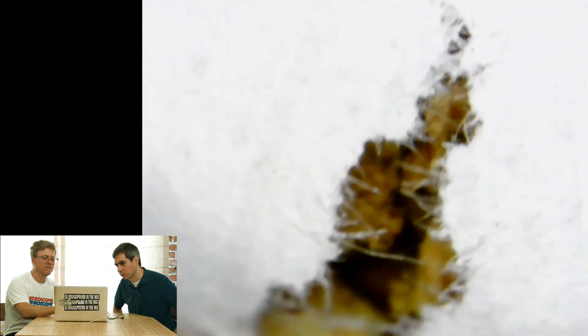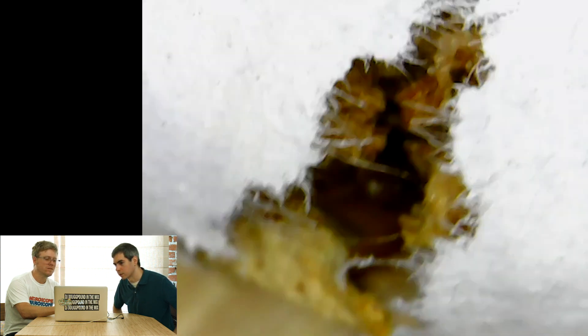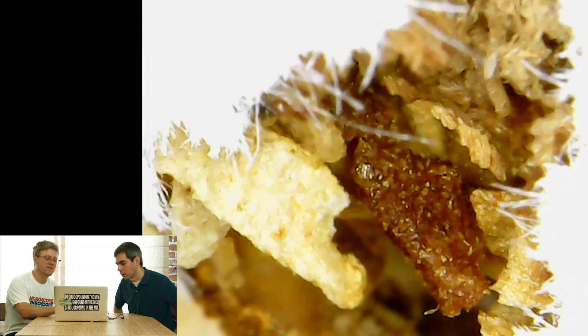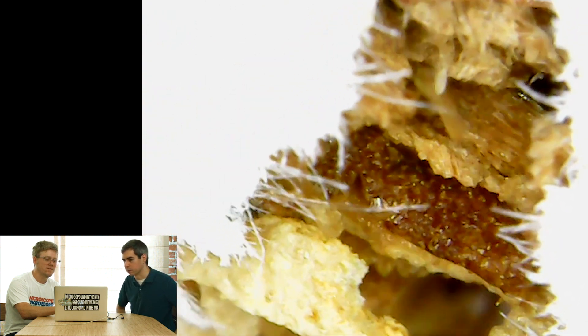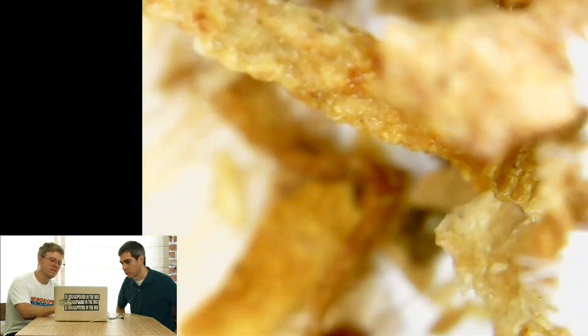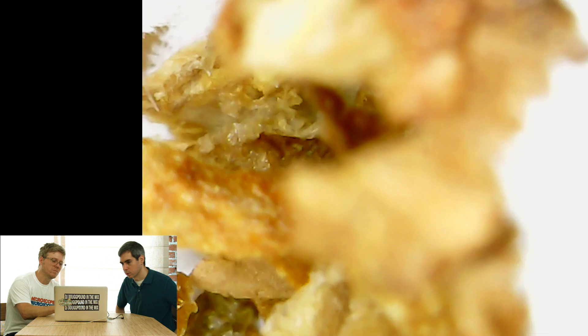Let me see if I can rip it open here. Get a nice focus going. I want to see those hairs from the paper. Your wish has been granted. Let's get a paper towel or something to put this over so we can see it show up more. That looks beautiful.